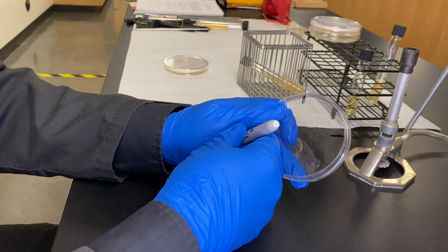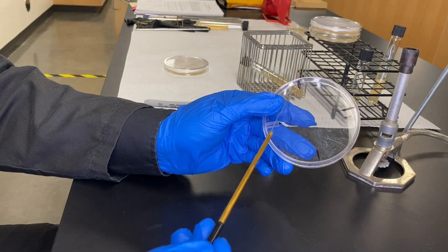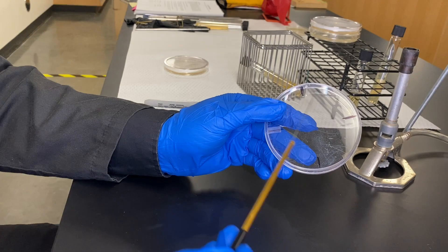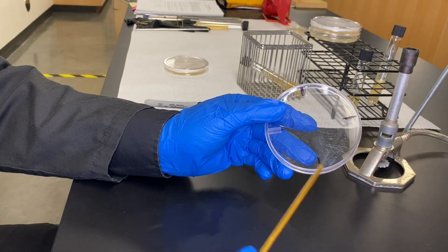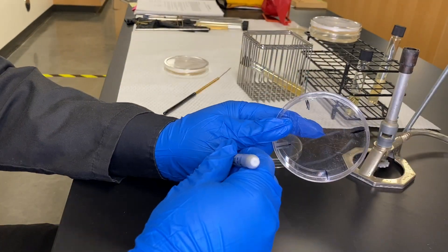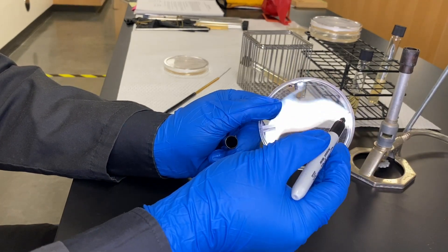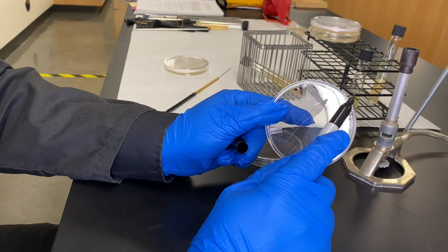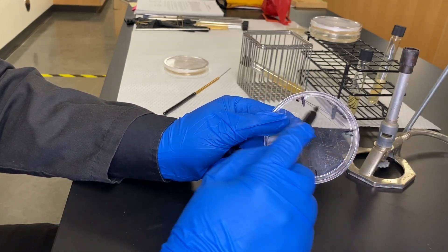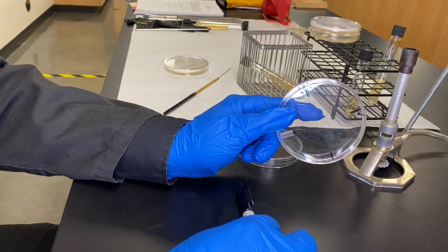When you have this plate, what you're going to be doing is taking your loop and streaking back and forth by crossing the lines. In other words, you want to go outside of the sections — not coloring within the lines, but going outside of the system. So we take our loop with the mixed culture sample and go from the outside of one side to the outside of the other, painting it back and forth — about three, four, maybe five times. One, two, three, four — making sure you cross the lines and go outside.